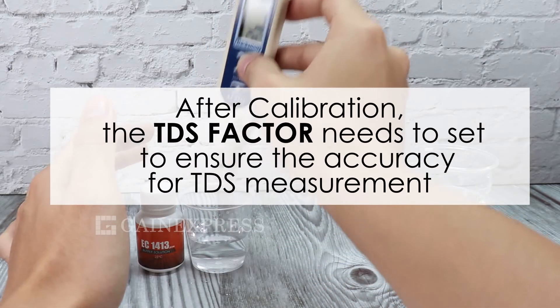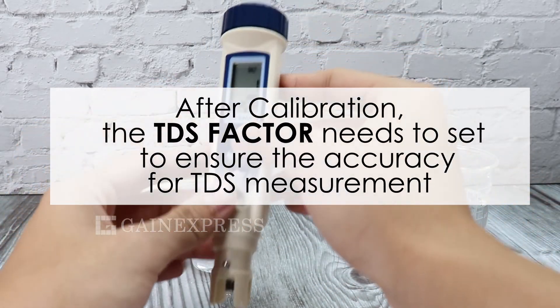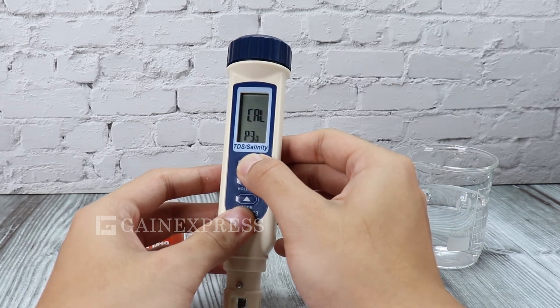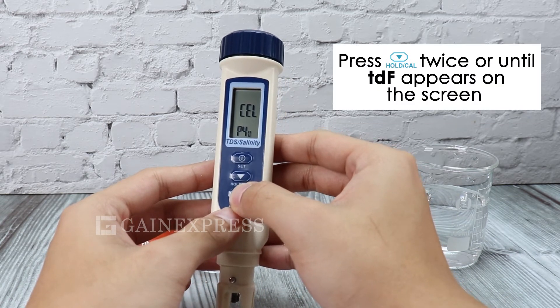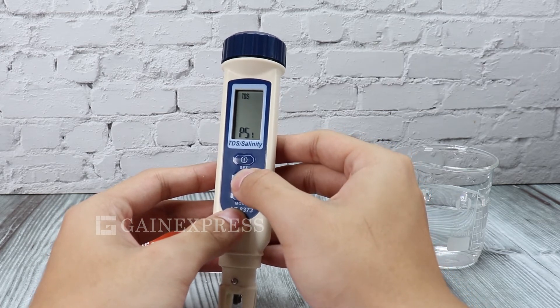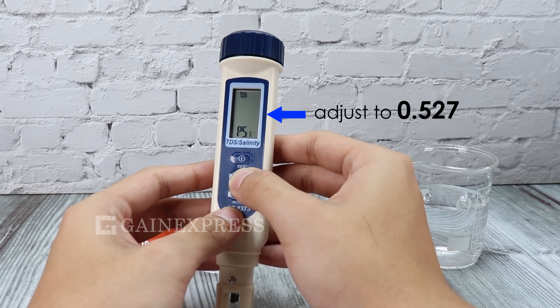After calibration, the TDS factor needs to be set to ensure accuracy for TDS measurement. Enter the TDF mode and press up and down to get the 0.527 value.